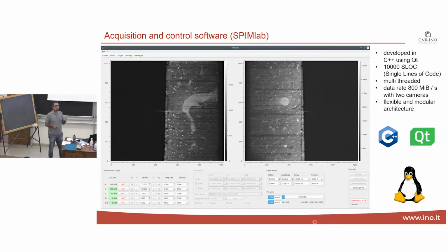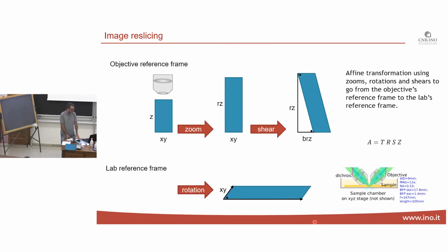So we have to use solid state drives. We have to do memory management very precisely. And so we had to develop our own software. You can find it on GitHub in case anyone is interested. Everything is written in C++ and runs on Ubuntu, which is nice because it has a very nice uptime. You don't want your system to start a system upgrade while you are in an acquisition, especially at night when it usually happens. And so we're happy about this.